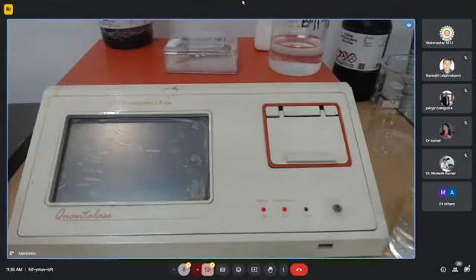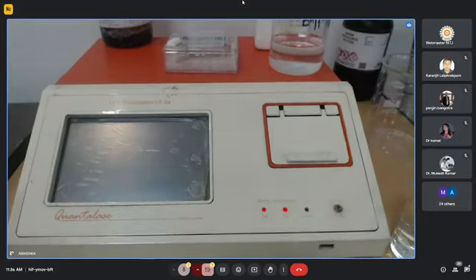Measurement of green fluorescence from uranium compounds is a known method for measuring uranium concentration in water samples. Earlier, the laser fluorimeter used nitrogen lasers, which emit a pulse of 337 nanometer, a natural choice for exciting fluorescence in early instruments. But a serious problem of that instrument was the limited life of the nitrogen laser tube, which was typically a few months.